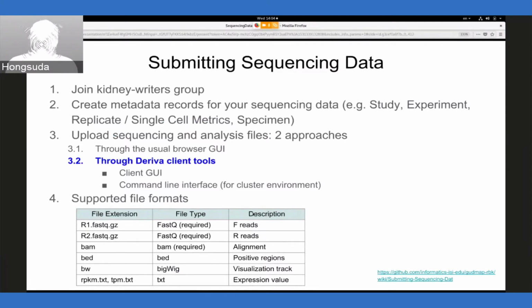Yes. So I'm asking because for 10x Genomics-based single-cell RNA sequencing, if I pool the files with the name ending like that and try to run them through 10x Genomics Cell Ranger, it does not like those file names. It needs, after R1 and R2, _001.fastq.gzip.